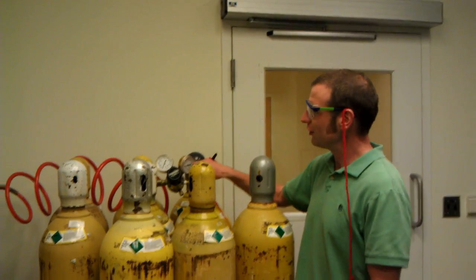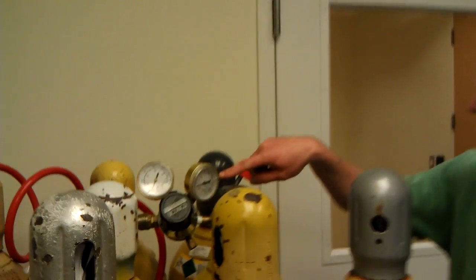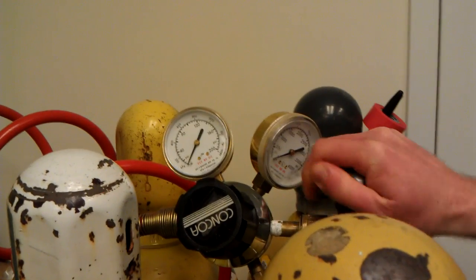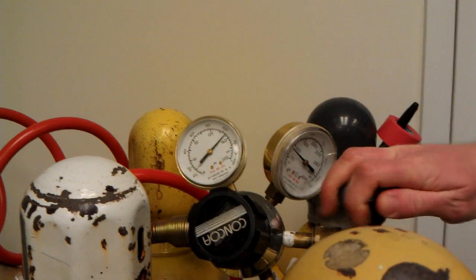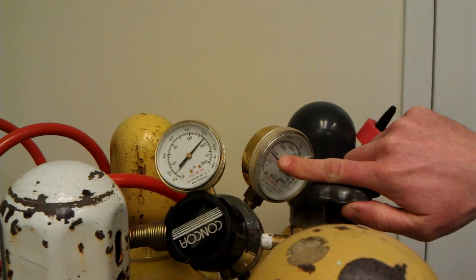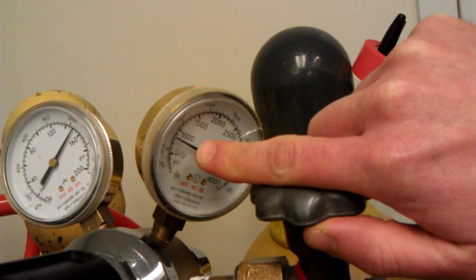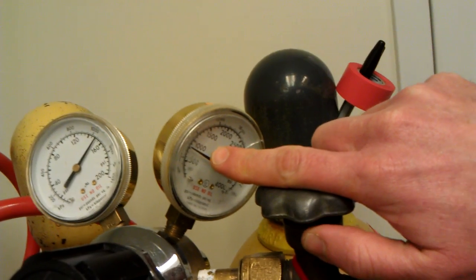This is where you turn the gas on on the tank. You should look here on the readout once you turn the tank on and make sure that there is at least about 700-800 PSI on the regulator when you get started. If there isn't, you should change tanks.